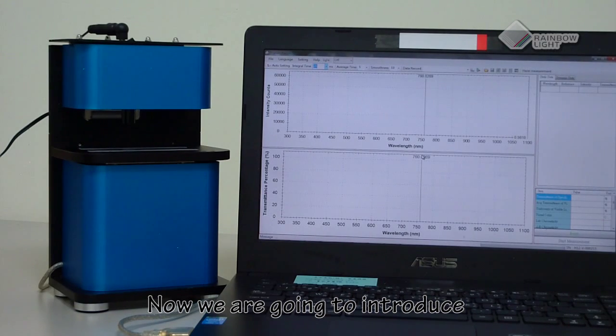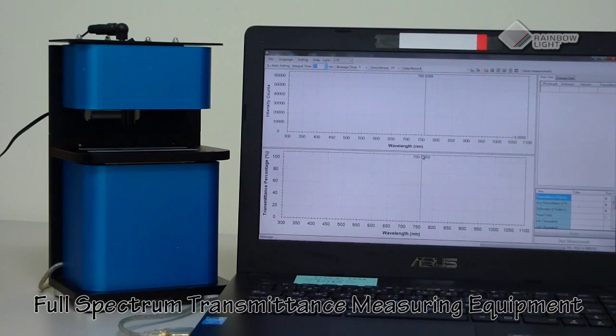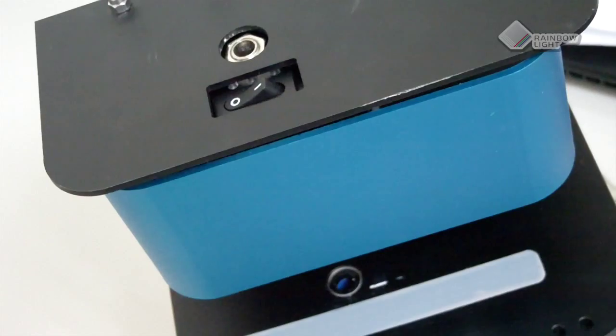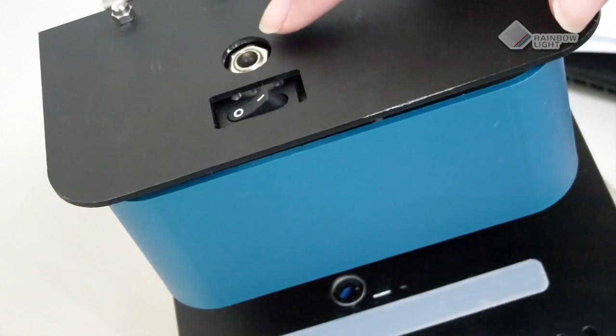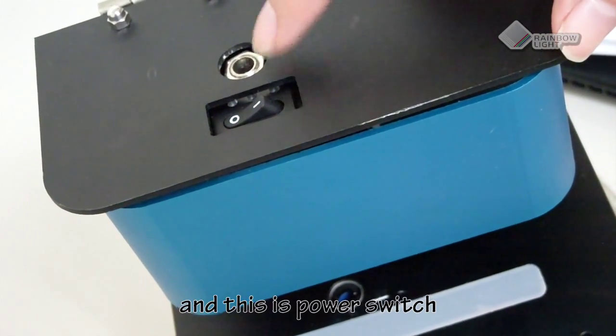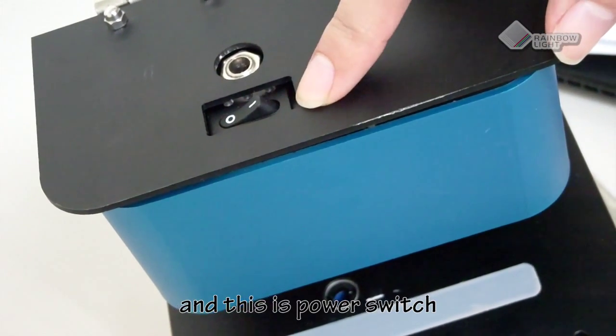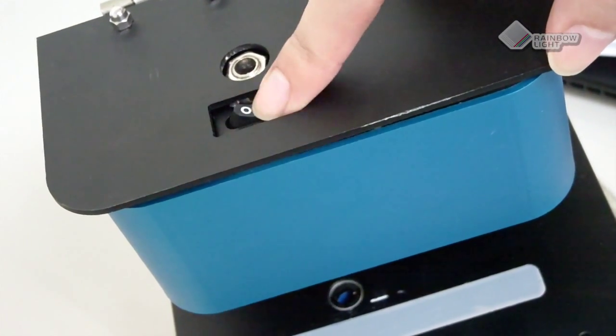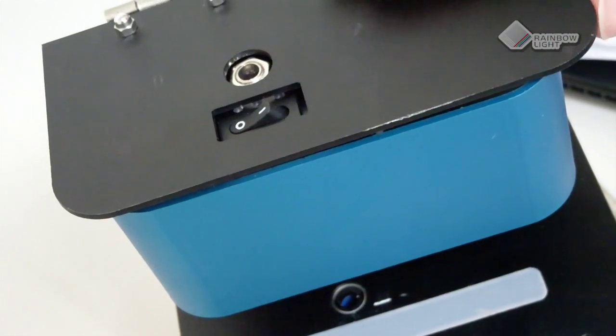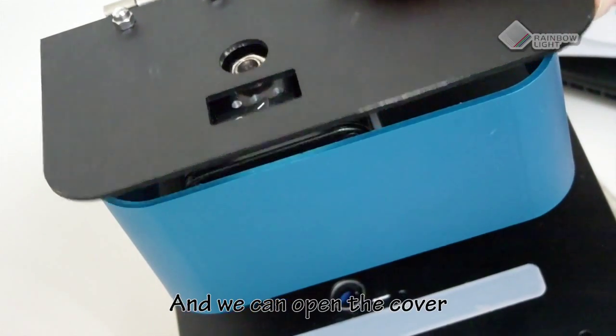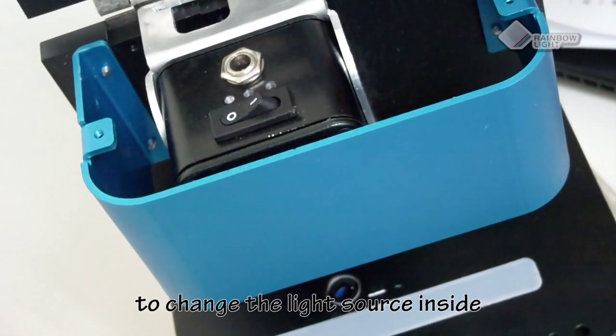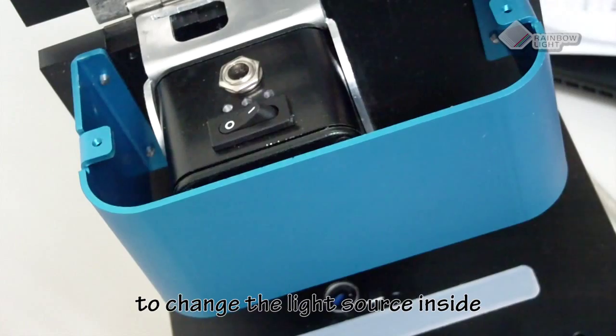Now we are going to introduce full-spectrum transmittance measuring equipment. This is the power plug and power switch. We can open the cover to change the light source inside.